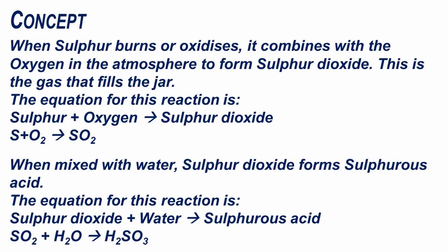When sulfur burns or oxidizes, it combines with the oxygen in the atmosphere to form sulfur dioxide. This is the gas that fills the jar. The equation for this reaction is: sulfur plus oxygen gives sulfur dioxide. S plus O2 gives SO2.